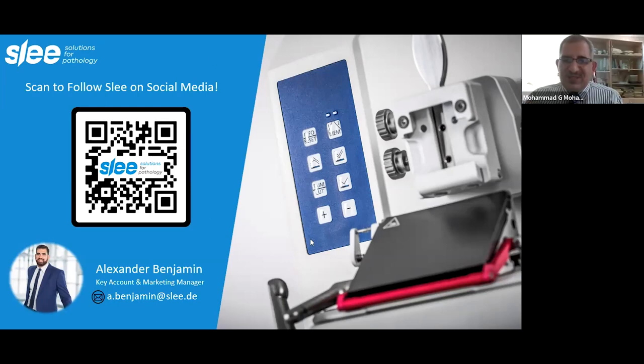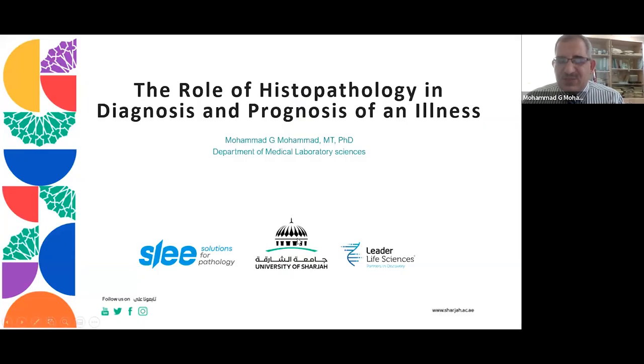Thank you, Malavika. Thank you, Alexander, for the beginning and the introduction of the portfolio of success in the field. Here I'm going to talk about the histopath techniques. I will go through the histopath techniques, what is meant by histopath techniques, and how histopath techniques serve the diagnosis and also help in the process of clinical diagnosis.